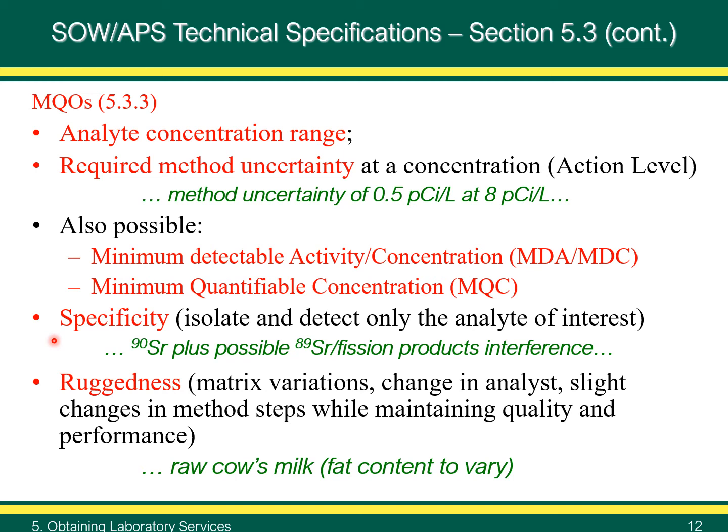The laboratory needs to select an appropriate method that combines chemical separations and a detection technique to accurately determine the strontium-90 in the presence of other beta-emitting substances such as strontium-89, while simultaneously addressing radioactive interferences such as yttrium-90, barium-140, lanthanum-140, and other fission products in the sample.